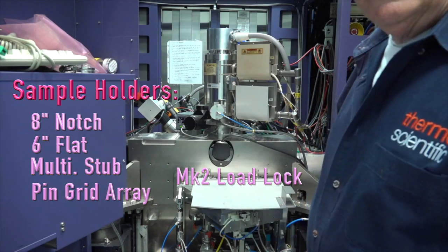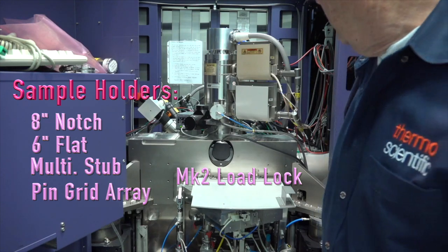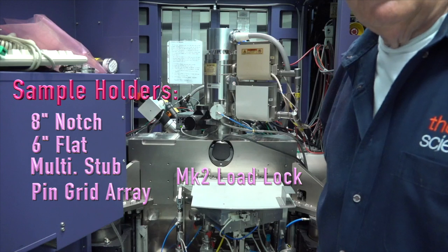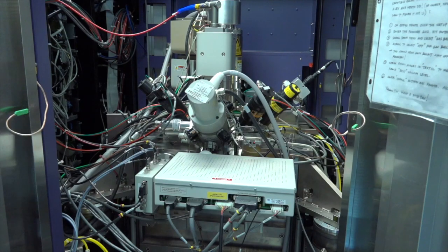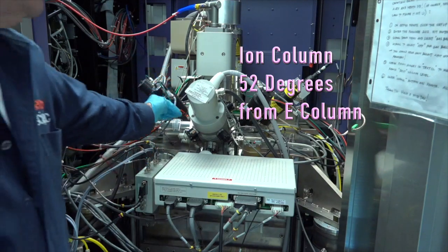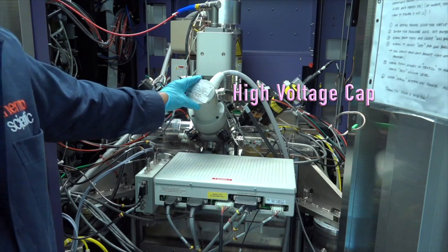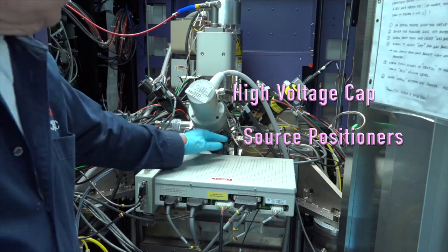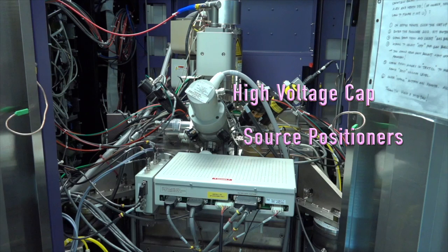On the back side, which you can't see from the front, directly behind the electron column is the ion column. On the back of the tool now, we're looking directly at the ion column. It's at an angle — it happens to be 52 degrees from here. This is the high tension cap for it. I've got a couple of black knobs here we call positioners, that help us move the source to go right down the middle of the column through several apertures.